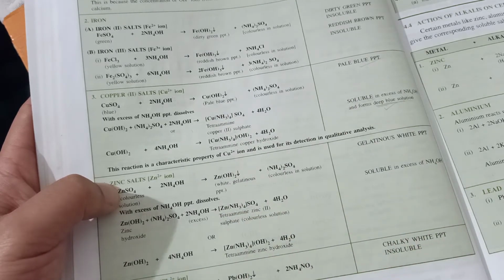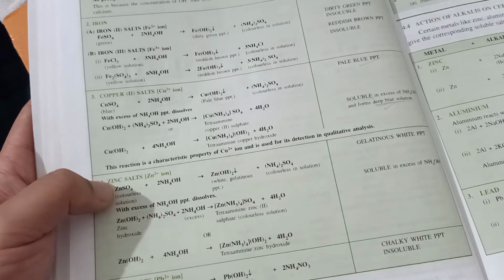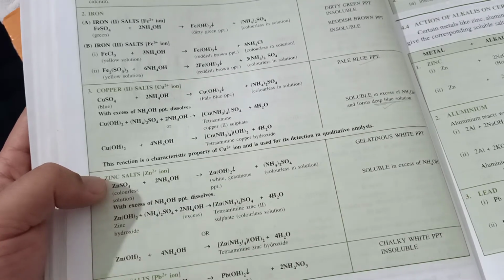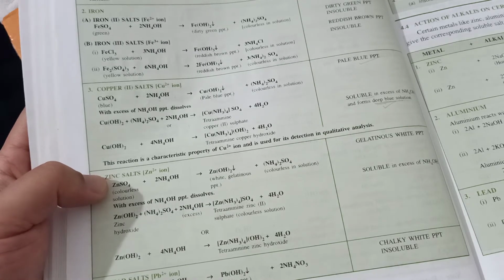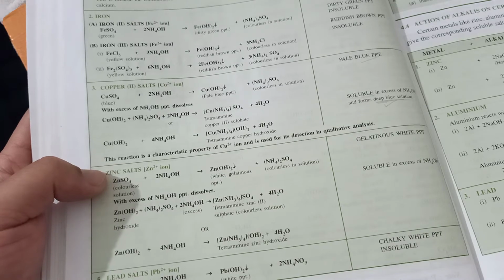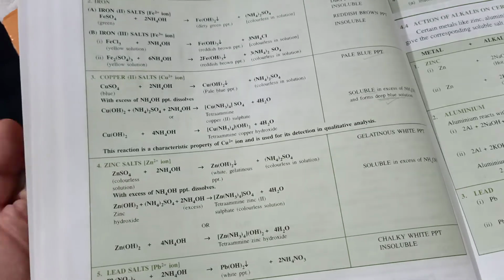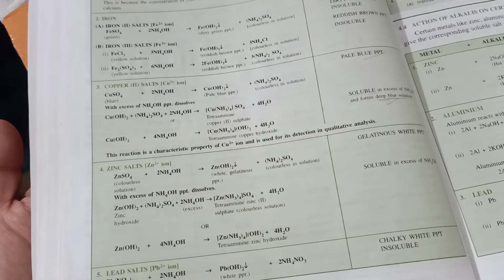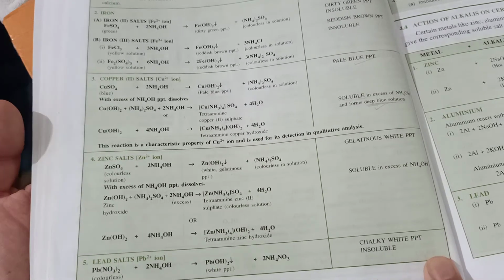So this reaction can also be used to differentiate between sodium hydroxide alkali and ammonium hydroxide alkali. So I have told you two reactions by which we can distinguish sodium hydroxide and ammonium hydroxide from each other.